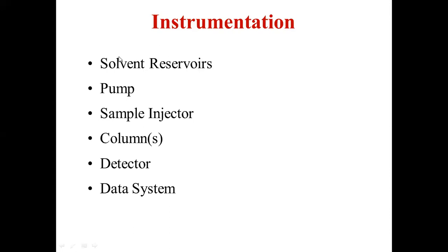This pump is connected to the solvent reservoir. By pumping, we can create the pressure so that the solvents present in the reservoir can be sucked into the capillary, and they can be made to flow towards the chromatographic column very simply. So solvent reservoirs are very important. They will be holding the liquids, maybe a single liquid or multiple liquids, whatever it is.